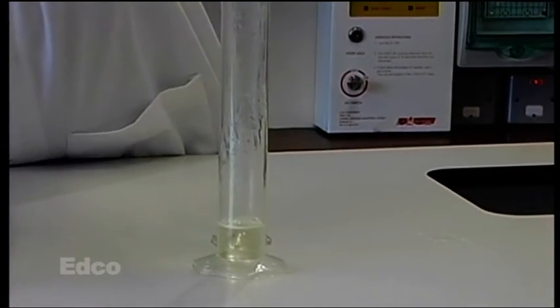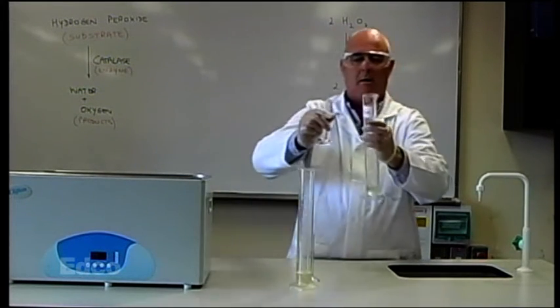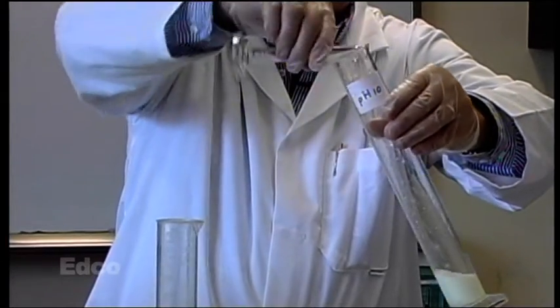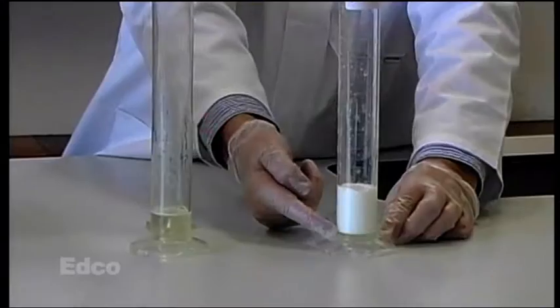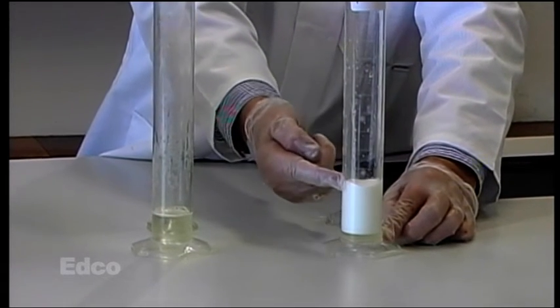If we take out the unboiled enzyme, and again mix the peroxide, straight away foam is produced. Oxygen bubbles are produced down here. They interact with the washing up liquid and foam is produced.